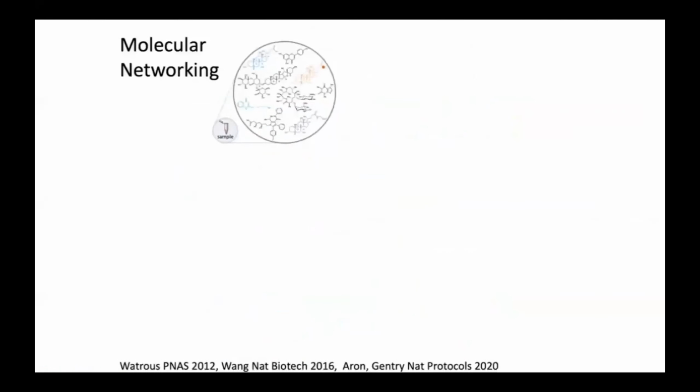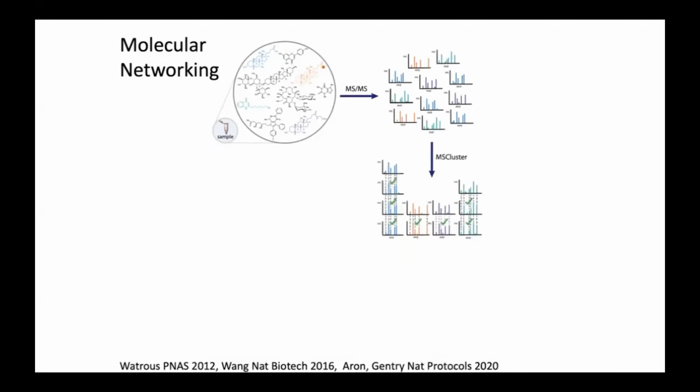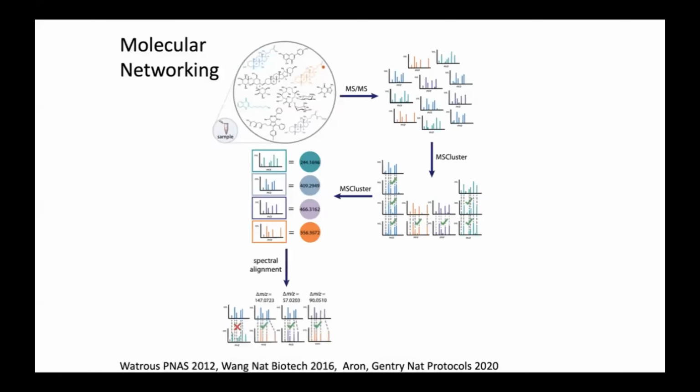To show you how this works, you first need to understand how molecular networking works. If you have a sample with a complex mixture of metabolites, in untargeted metabolomics, we fragment all the ions that are observed. So we get these fragmentation patterns. We then merge all identical spectra and represent those as nodes. Each of these nodes, the way you can think about it, represents a unique molecule. It's not a perfect picture, but for the sake of this talk, that's how you should think about it. Each node is a molecule.